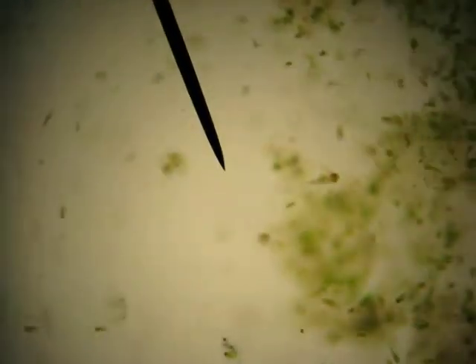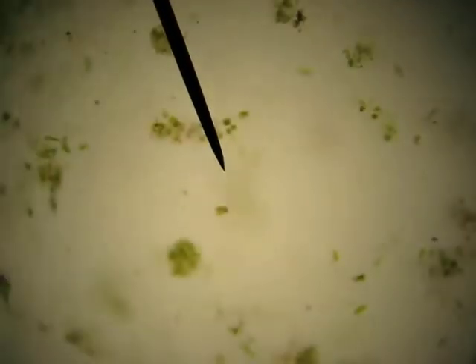Let's try and find some paramecium. And these guys are almost see-through. So they're hard to find sometimes. Let's try and go where they're congregated here at the bottom. Ah, I see some. I just got to get it focused. There they are.